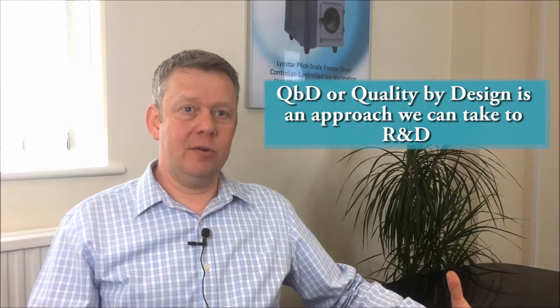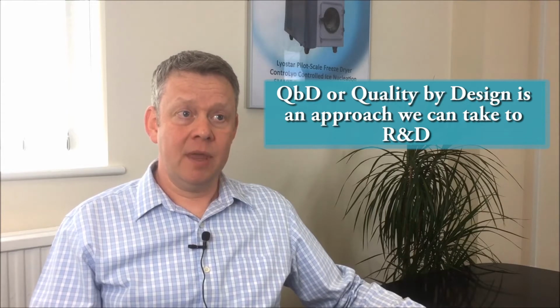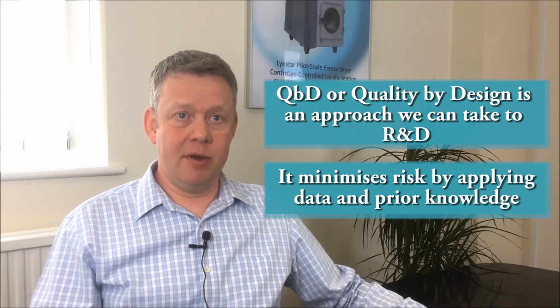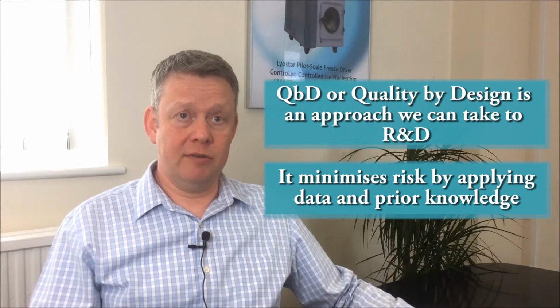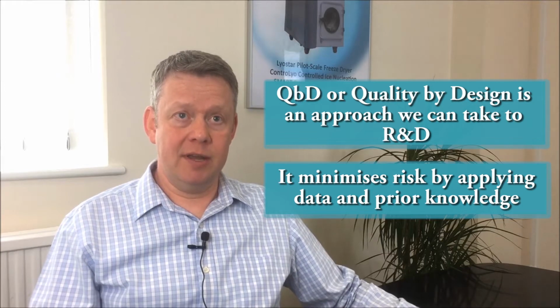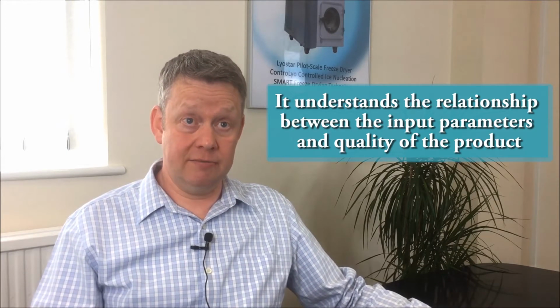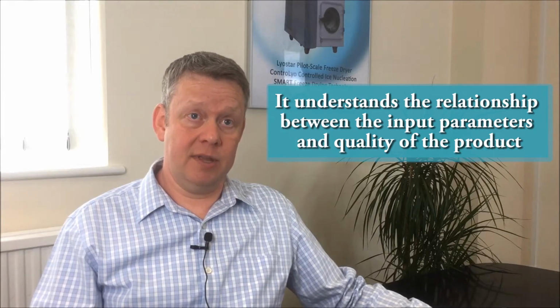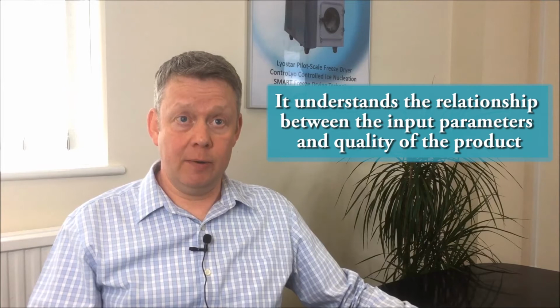So QbD, or quality by design, is an approach that we can take to R&D with the idea that it minimises risk by applying data and prior knowledge right from the beginning, rather than just going into the lab and starting the experimental work. And also part of it is to understand the relationship between the input parameters and the quality of the product, with the idea being that we learn more about our process as we go along.